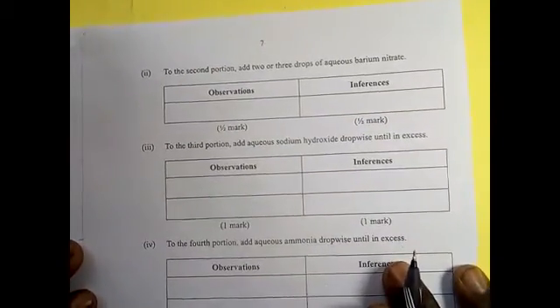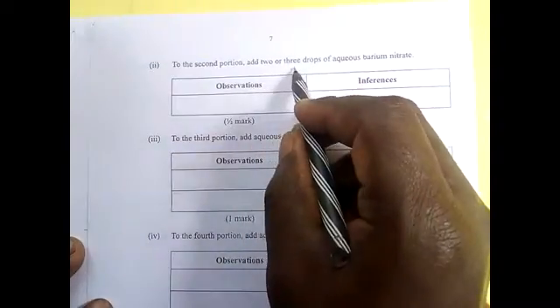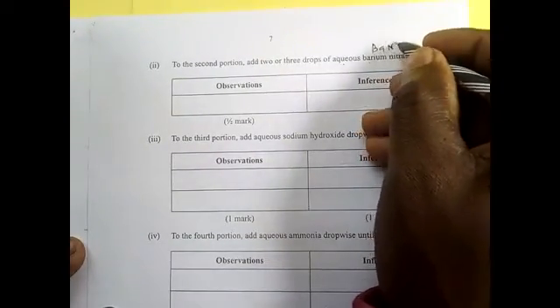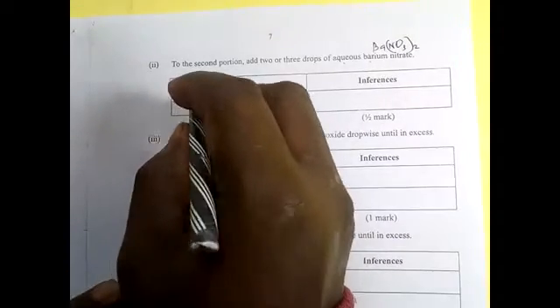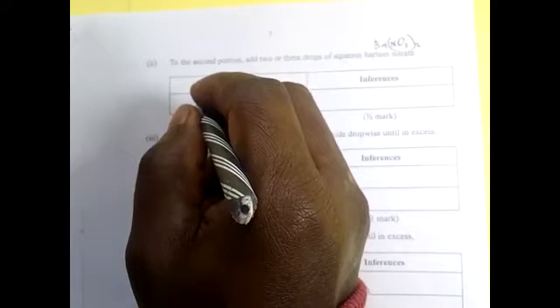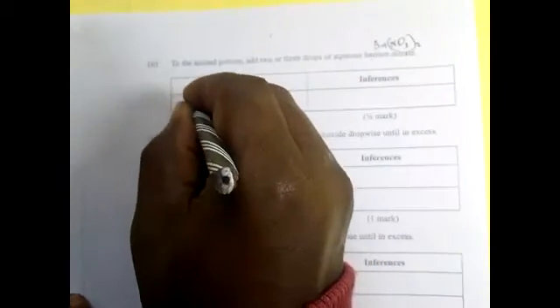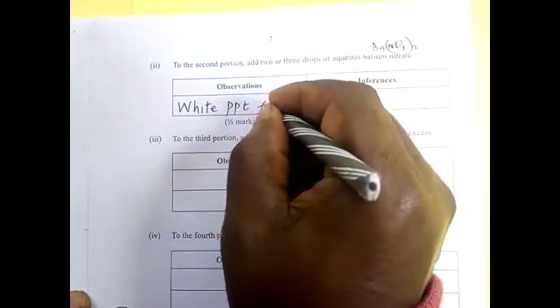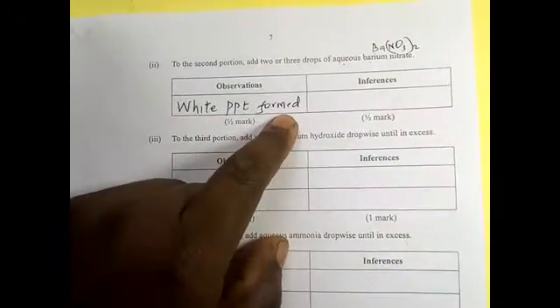To the second portion, add 2 or 3 drops of aqueous barium nitrate. And then the observation is that a white precipitate is formed. White PPT formed. So a white precipitate has been formed.